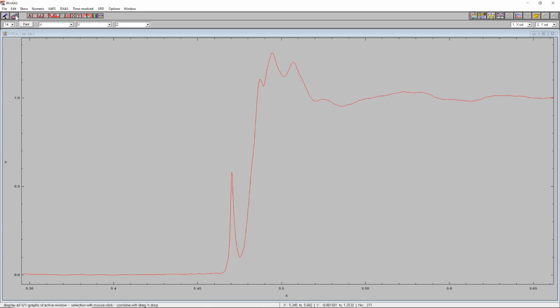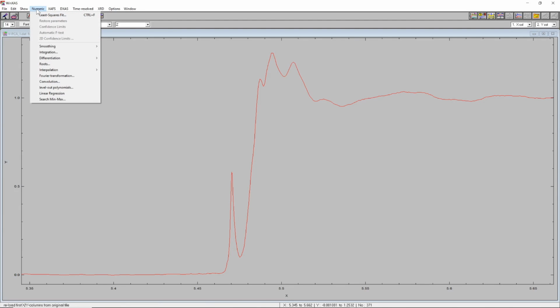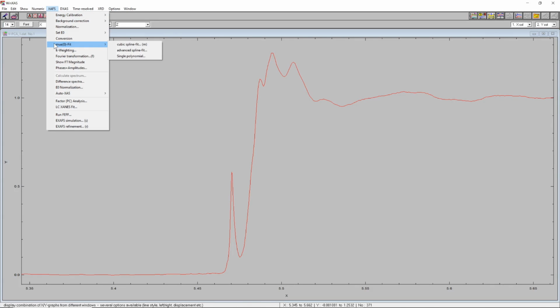The details are described in the manual, but basically all the items you find here for data treatment or data reduction or data analysis can be saved into a macro. Multiple steps of those can all be saved in one macro.